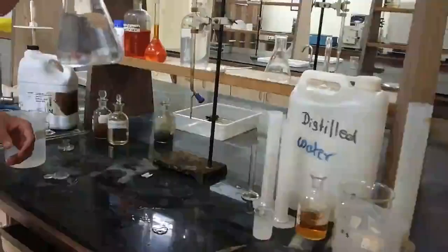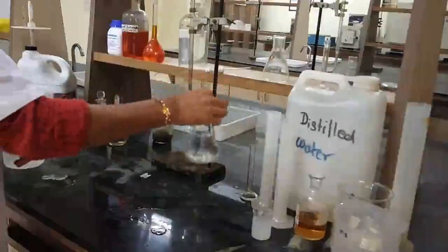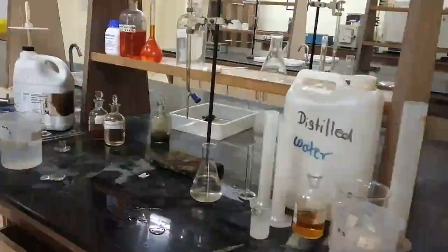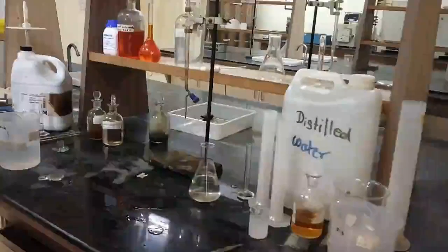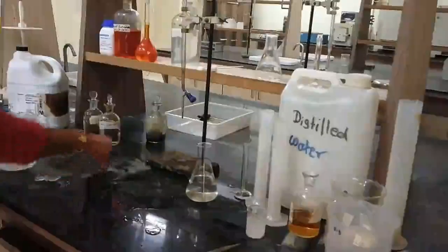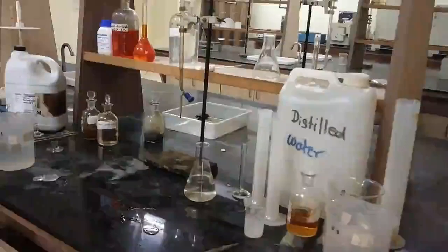So we started with a blue color. Then we got faint blue color, and now this is totally colorless, and this has obtained the reading 5.9 ml. So this is the entire titration process that we did. So now we have got the value of X, which is to be put into the formula for finding out the DO value.